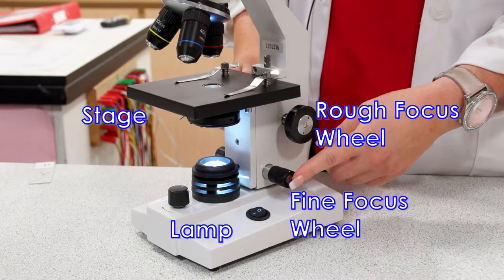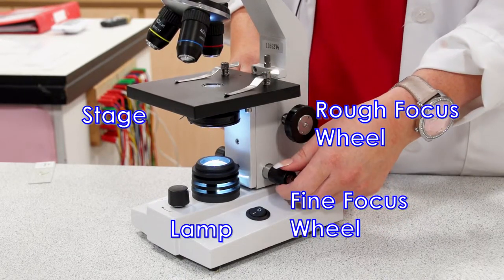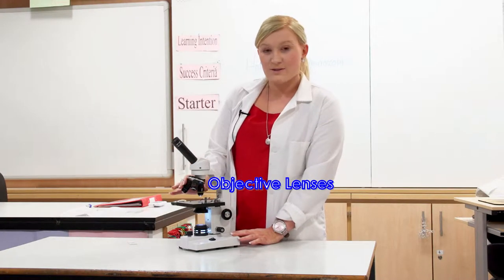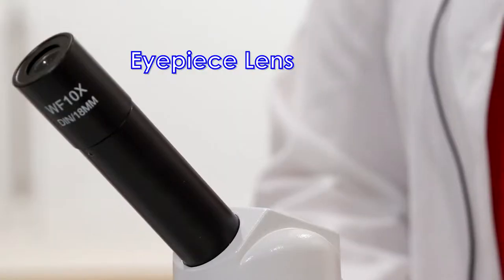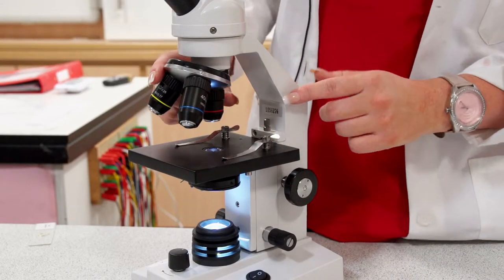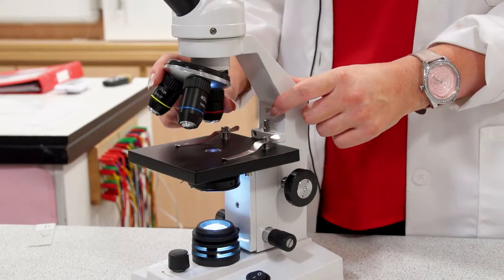You've also got the fine focus wheel, which can make your image clearer. These are our objective lenses. You've got stage clips on the stage—these hold your slide in place. You would look through the eyepiece and through the objective lens. You should always start with the smallest objective lens.